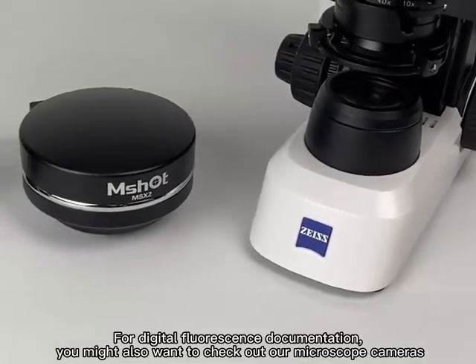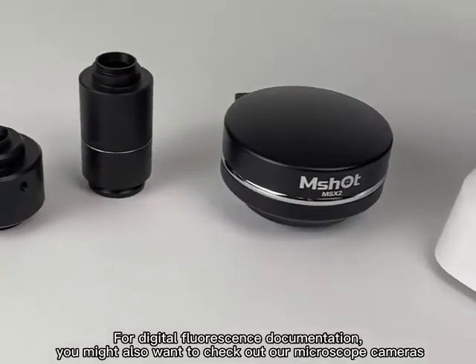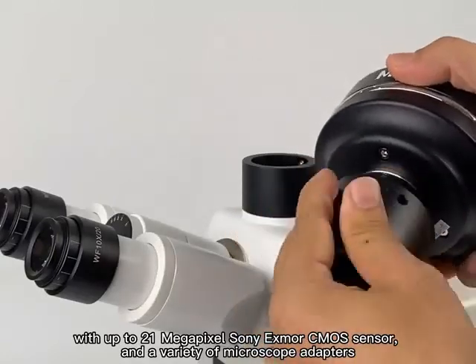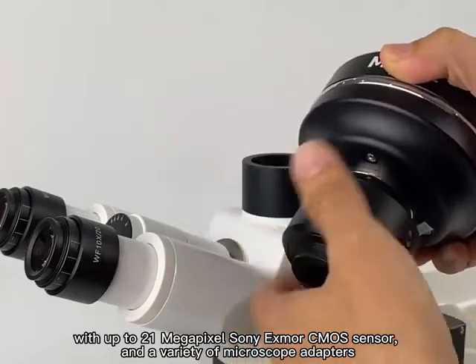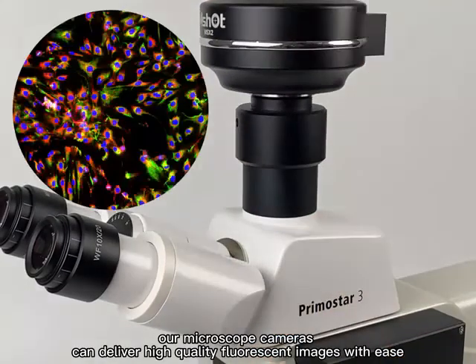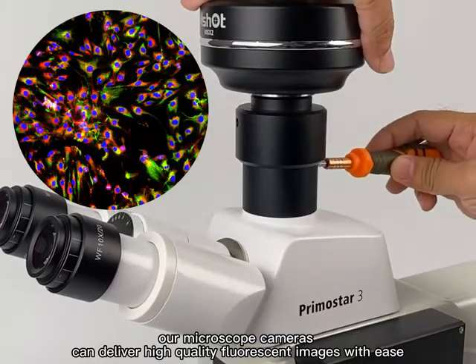With up to 21MP Sony Exmor CMOS sensor and a variety of microscope adapters, our microscope camera can deliver high-quality fluorescent images with ease.